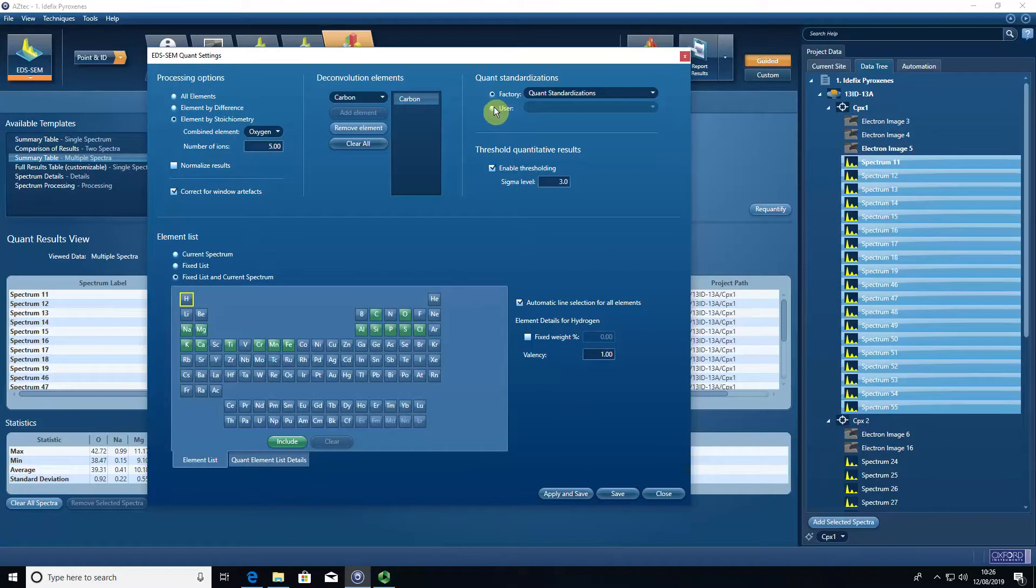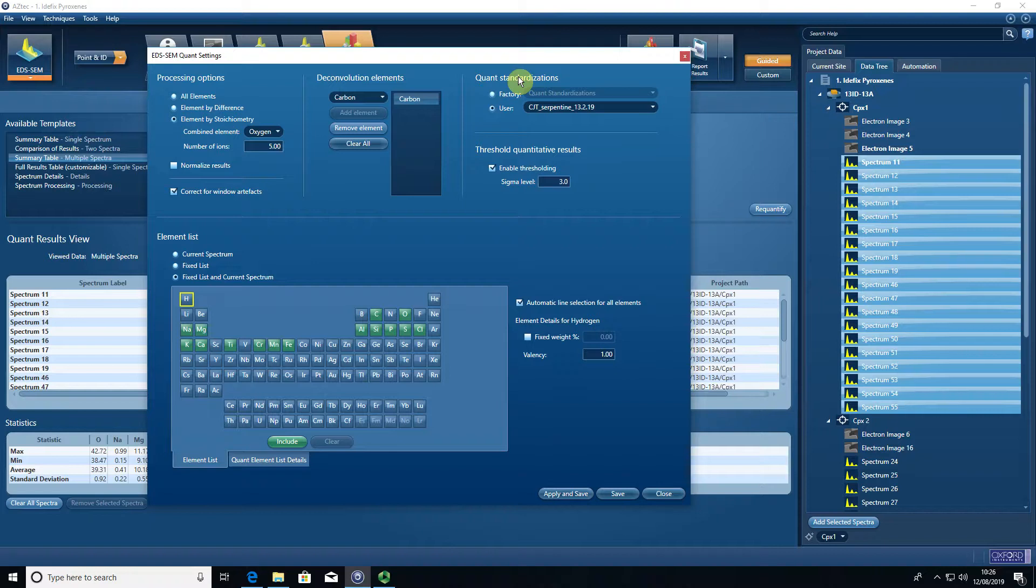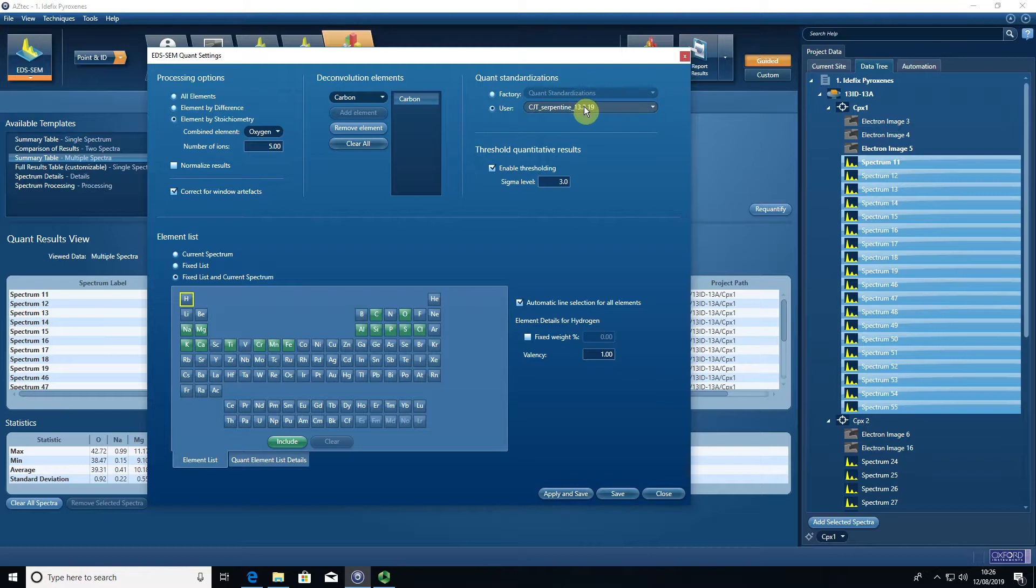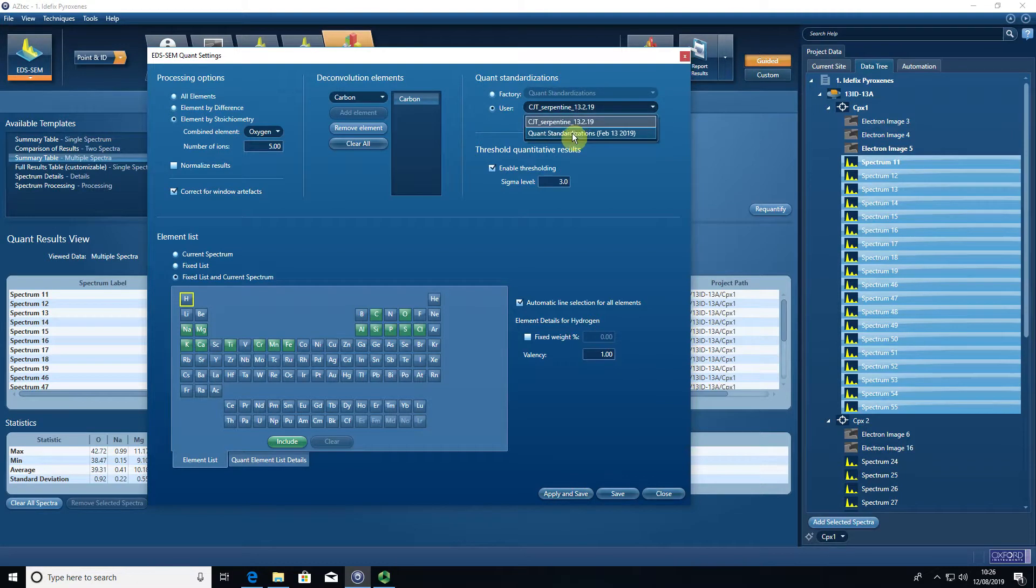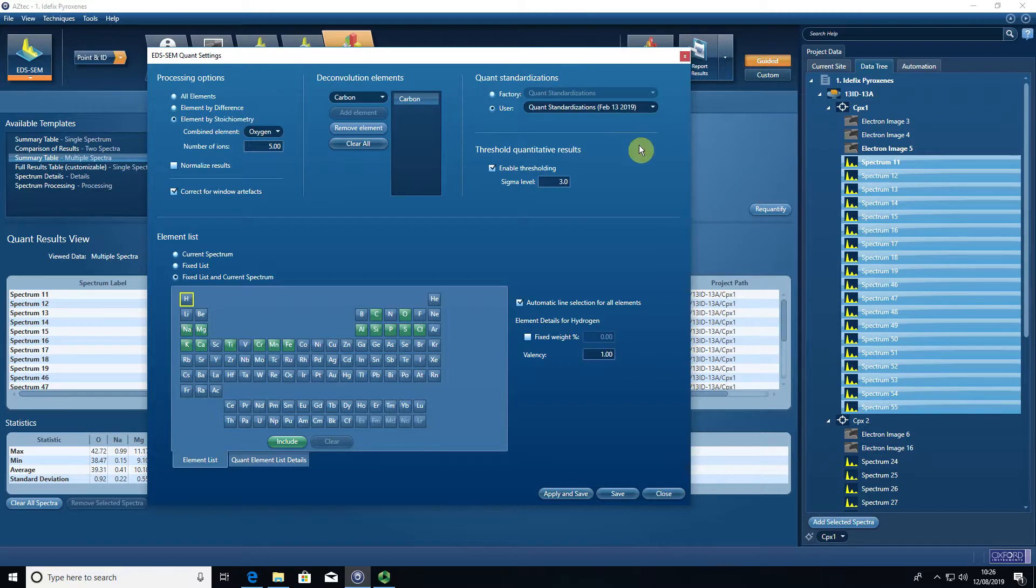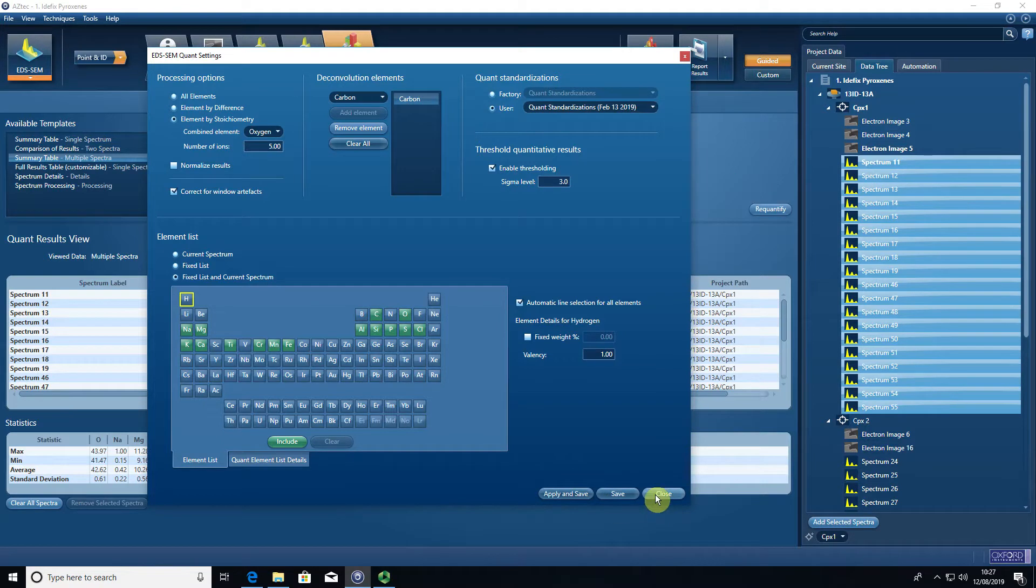The next really important thing you need to do is select the standardization that you used. During your analytical session—and this is why it's really important to do it at the point of acquisition rather than in data processing—when you're on the acquisition computer you will have an active standardization. Let's say in this case it was quant standardizations Feb 13th. It's really important that that is selected because we apply that to the data to make sure our numbers that come out are accurate and that they're based on the secondary standards that we analyzed.